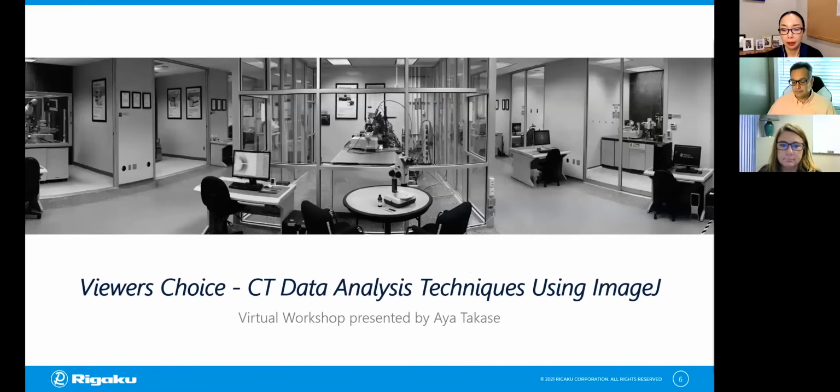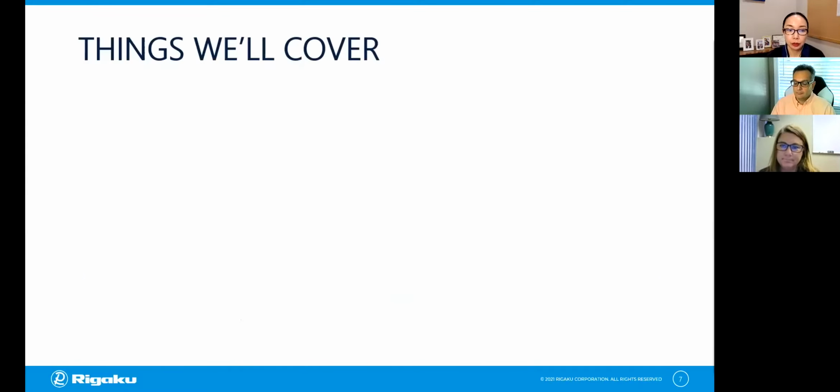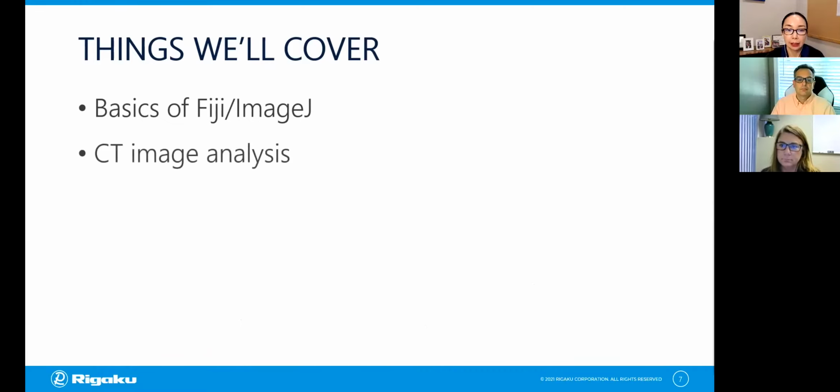Thanks, Tom and Angela. And thank you everyone for attending the workshop. As always, we are presenting live from our office in the Woodlands, Texas. And today's topic is viewer's choice. So we asked the viewers to vote for a favorite topic, and you chose CT data analysis using ImageJ. So that's what we're going to cover.